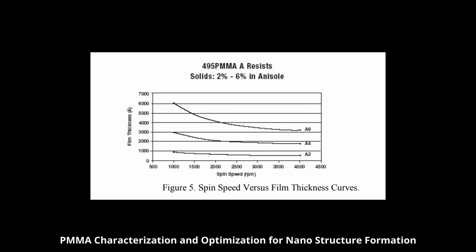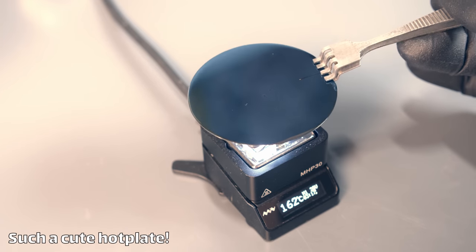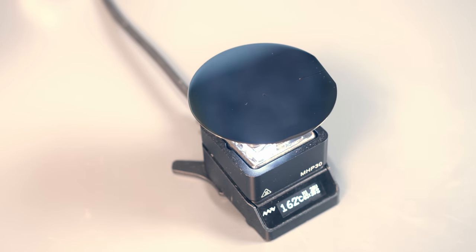PMMA is one of the classic resists for electron beam lithography. It's cheap and easy, has a really wide process range — you can spin it down to just tens of nanometers or build up layers a couple microns thick. It's moderately sensitive with decent contrast, and it's just in a sweet spot of being easy to work with. After spinning the resist on, you bake it on a hot plate for a couple minutes at 150–160°C to flash off any remaining solvent.